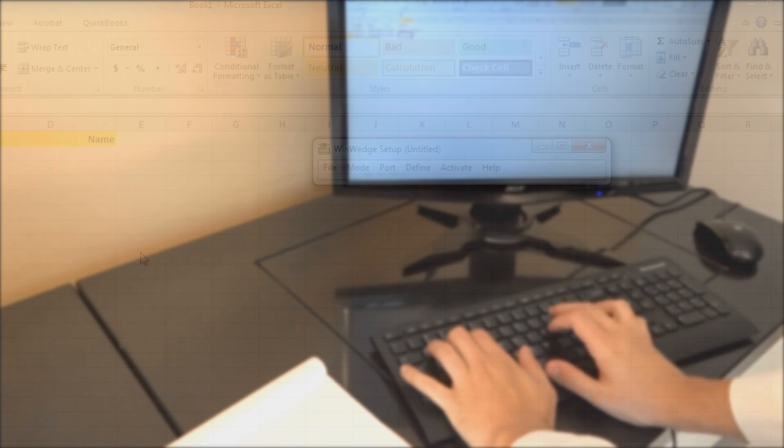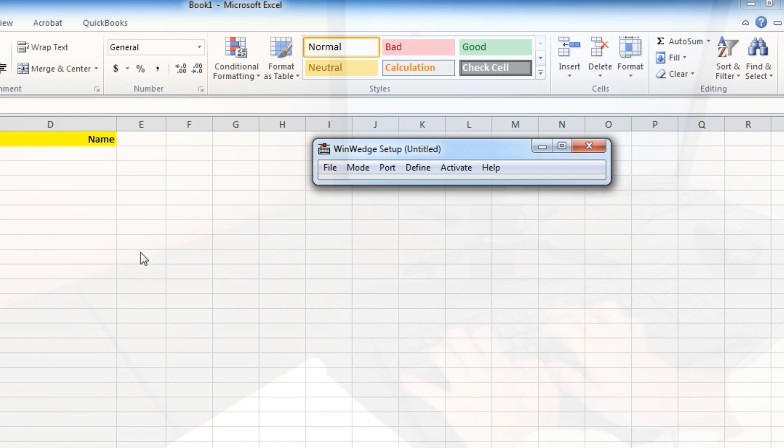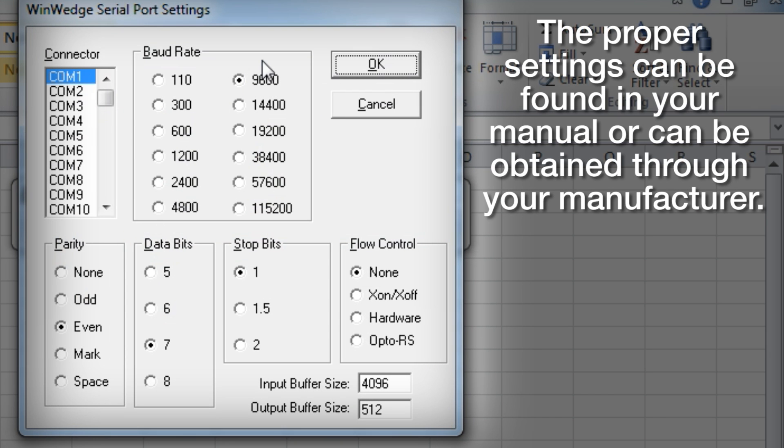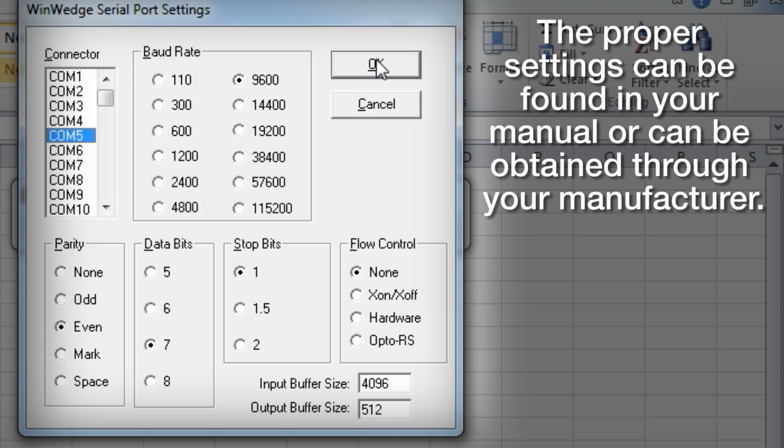Once you have your software installed and your weighing instrument connected, you will need to find your scale or balance's connectivity settings provided by the manufacturer to set up your software.